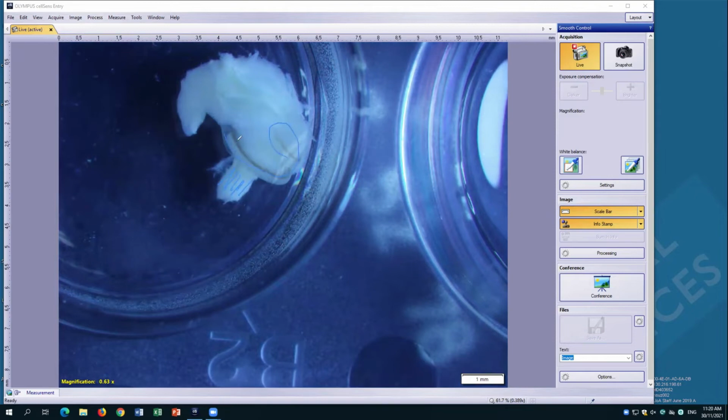Now you see quite a stretch of pigmented cells. So this is the area of the spiral ligament that contains a lot of vasculature and fibrocytes and supports the physiology inside the cochlea. It's actually quite funny how pigmented it is and why you need a pigment inside the ear, but that's something we see all the time. And to be honest, for microscopy, it's actually a little bit of a pain.